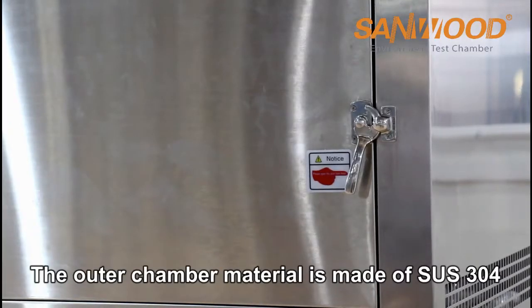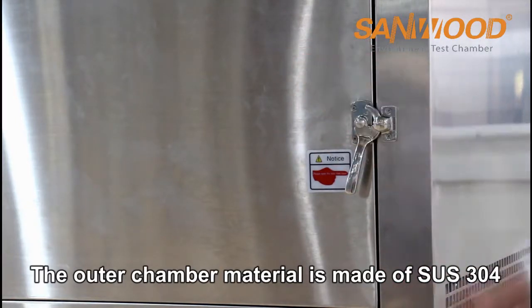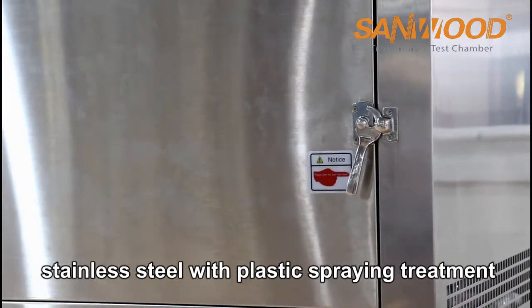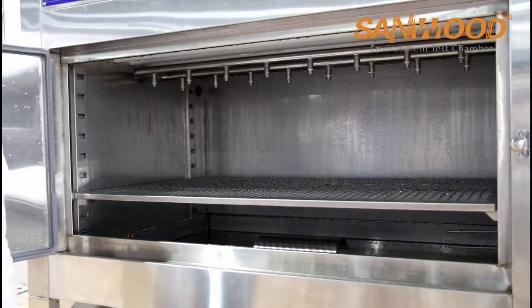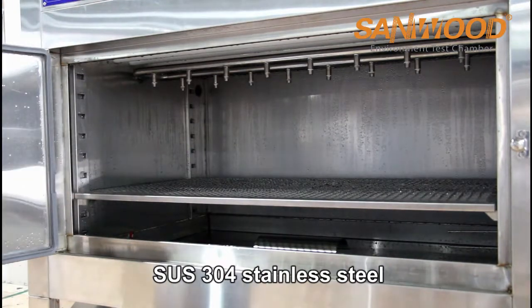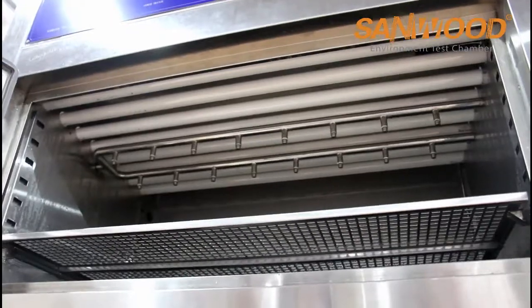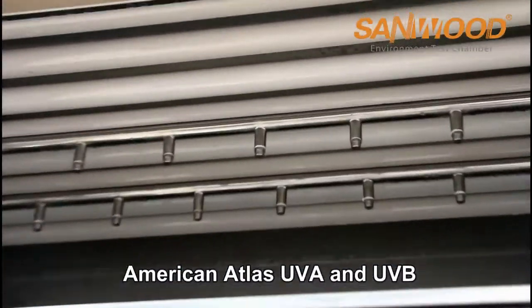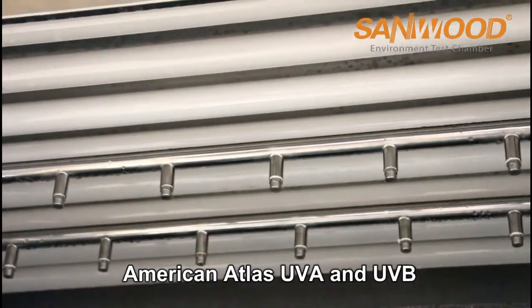The outer chamber material is made of SUS304 stainless steel with plastic spraying treatment. The inner chamber material is also made of SUS304 stainless steel. Equipped with 8 pieces of UV lamps from America ATLAS, UV-A and UV-B.